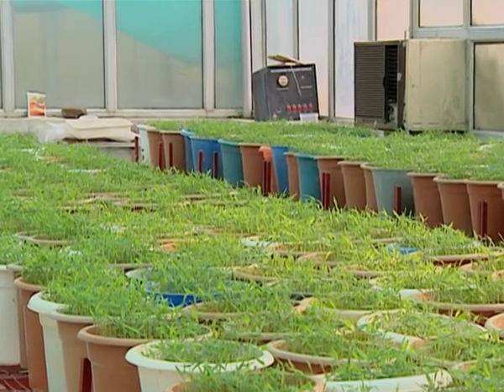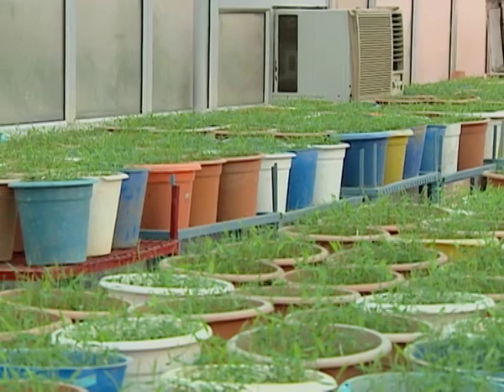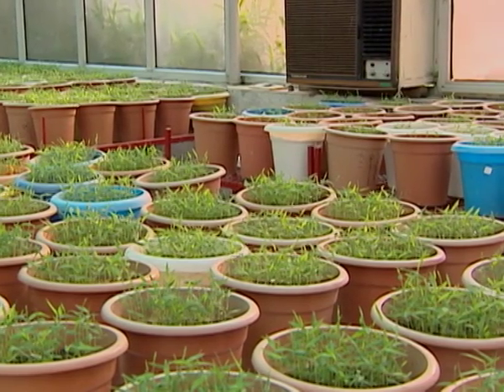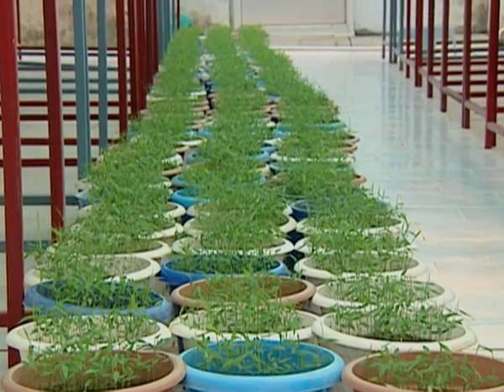The greenhouse and fields have substantially lower relative humidity, higher light intensity, and septic environment, and are therefore stressful to the TCPs because they have been drawn out of their comfort zone of in vitro conditions.